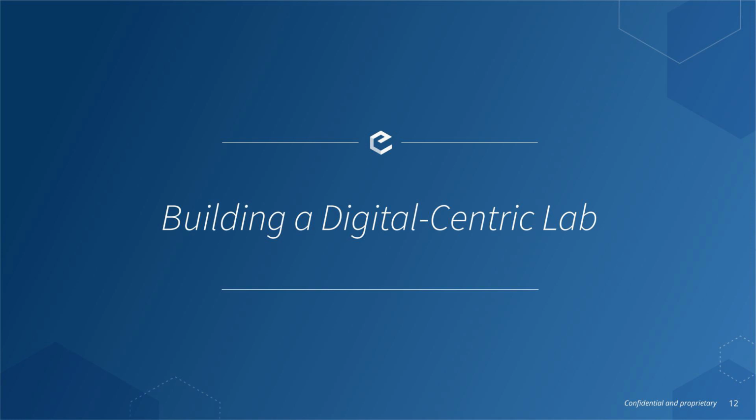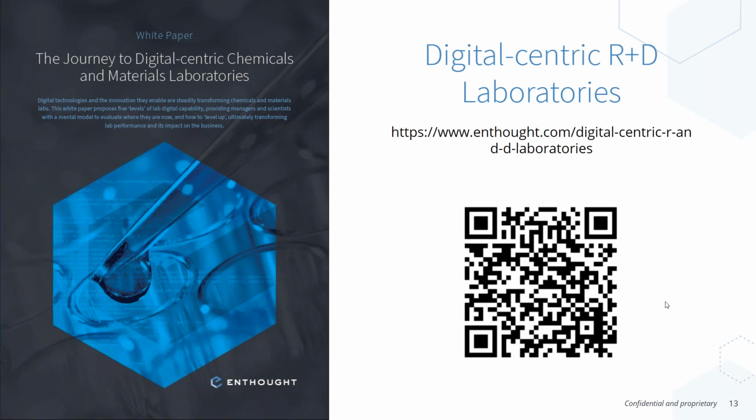So I'm going to talk through this topic called building a digital-centric lab, and I'll explain what that means. This stems out of an effort that Chris and I have worked on for a while now, as we look back over our experience in this industry and our experience talking with people working in this space. Last December, we published a white paper, which distilled much of our experience and thoughts about working with industrial R&D labs over many years into a framework to help researchers, lab managers, et cetera, develop an understanding about where to start, what to shoot for, and how to find success along the way throughout their R&D digital transformation process. If you want to read more about this, you can find the white paper by following this link here. But I'm going to go into a lot of the content that's in the white paper in this talk today.